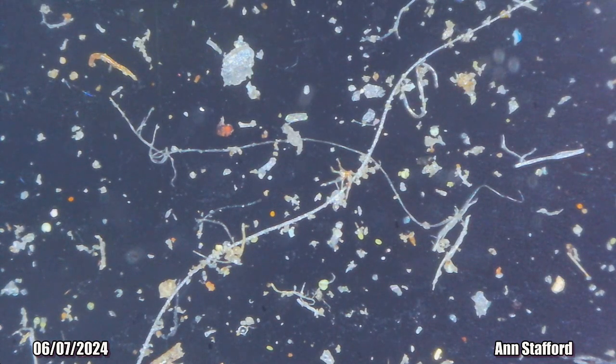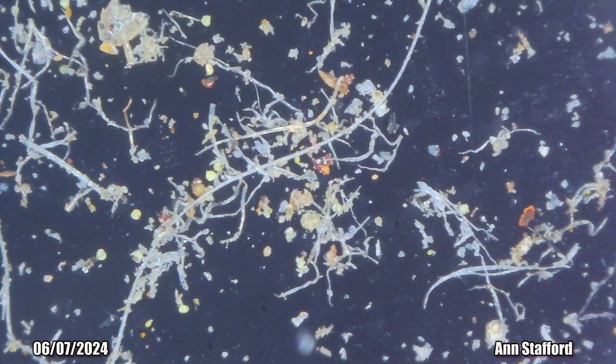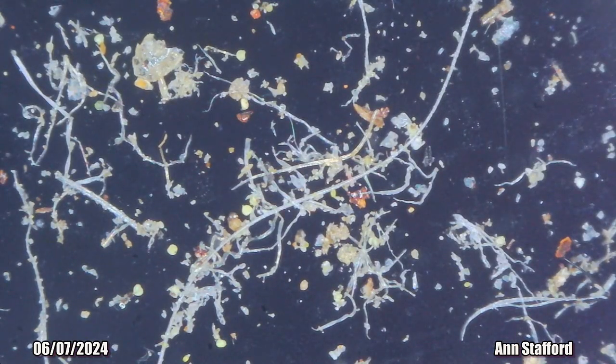I could try to put it in something a little more, but yeah, good luck trying to pick out a fiber out of dust. It's literally magnified 1,000 times. I'm never going to find this fiber with my eyes, so it's going to have to stay where it is, contained on this surface with glass on top of it, and I will try to keep checking this. If I was smart, I would have a notebook, and for all of the different things that I want to keep monitored, I'd have their little coordinates where they can be found.